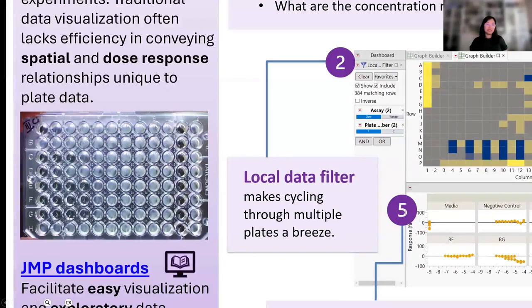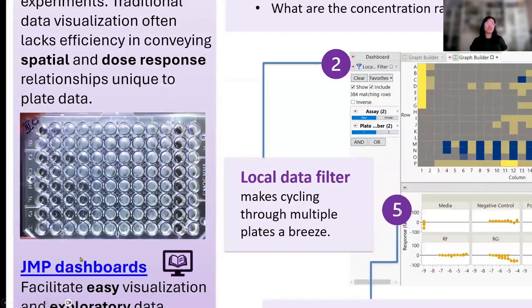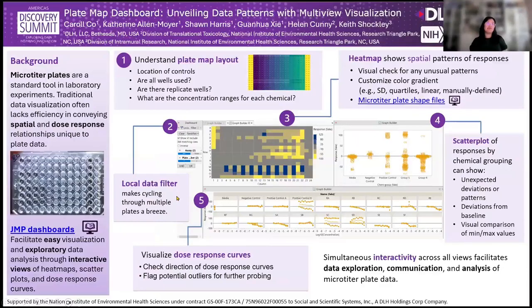In my experience working with the scientists, they usually run these experiments using several plates to account for the different factors that they're interested in. Examples of these factors might be the type of assay, cell culture, or the number of test articles that they want to experiment on. And usually when I get the data from these experiments, I get them all at the same time. So typically I'm dealing with several thousand rows from dozens of plates.